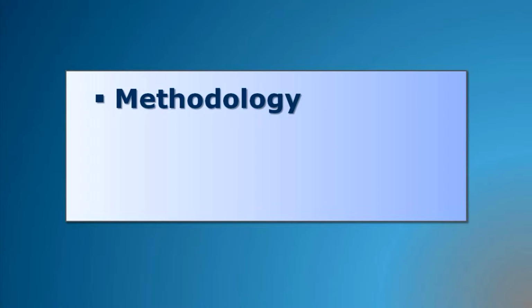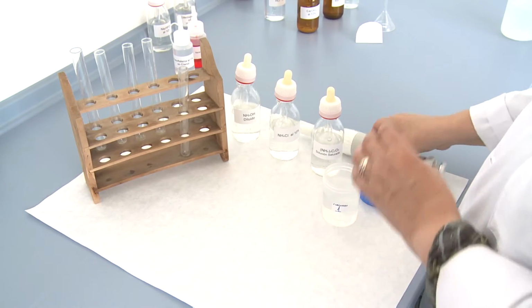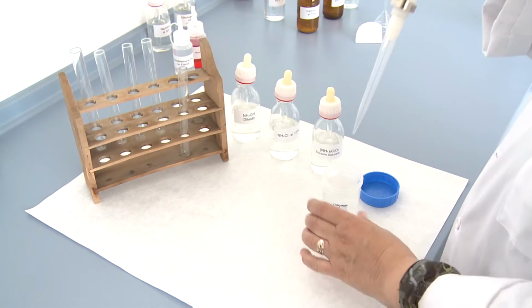Methodology. Research of calcium. We introduce 5 ml of the problem water.